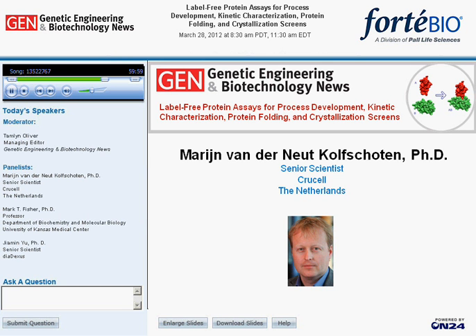If we have an antibody, we always try to get the Fabs to measure the one-to-one binding to the antigen. For the fitting, we use the one-to-one model, and that can be either the partial fitting or the full fit model supplied by the ForteBio software. In general, that's the best way to get the individual binding rates, from which in the end you can also calculate the equilibrium dissociation constants.